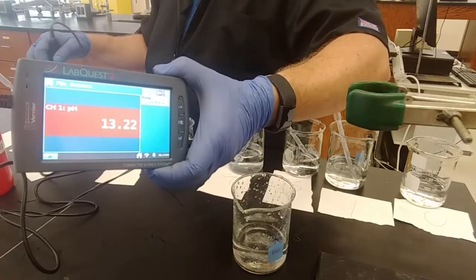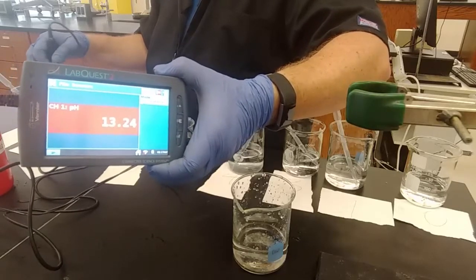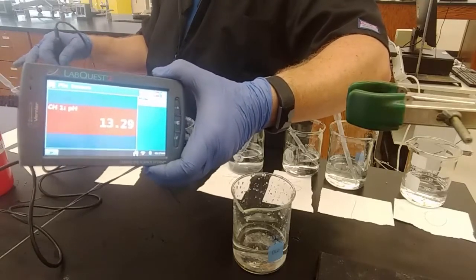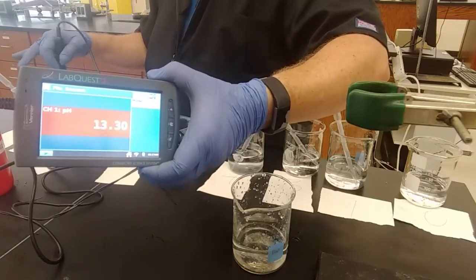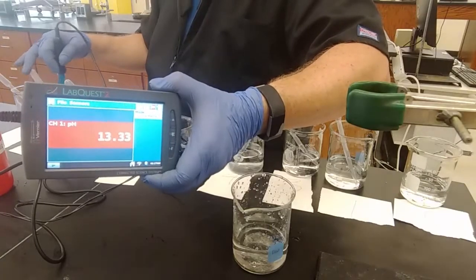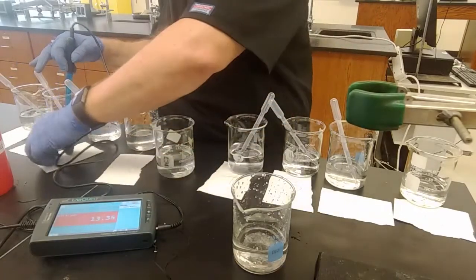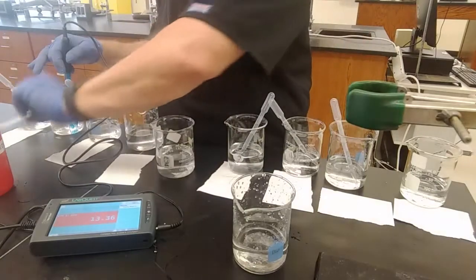90 milliliters of water, 10 milliliters of pH 14 base. But let's check the 14 and see where it is. Again, the meter might be miscalibrated, and our water certainly seems to be off. 13.31, let's say. 13.33. How about? Yeah, 13.33. We're expecting 13. We got a 13.33.